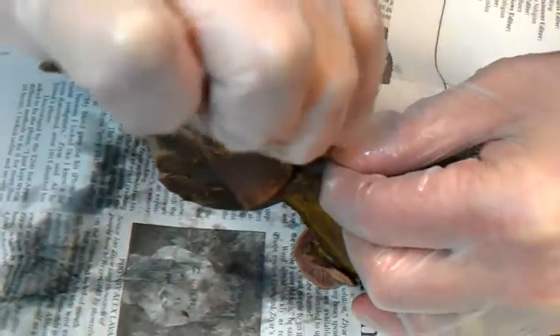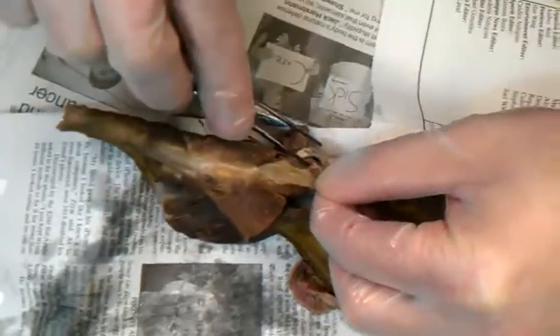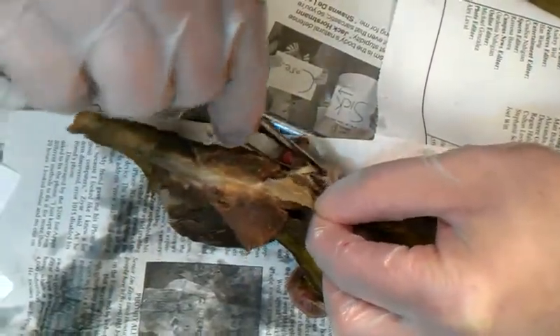The middle one is called the? Gluteus medius. And the smallest one is called the? Gluteus — this is a smaller mink, it's a little harder to see this. Okay, so there's your three glutes.